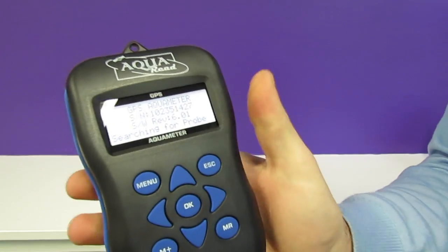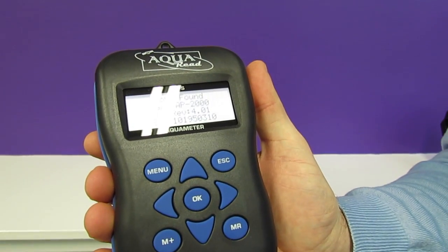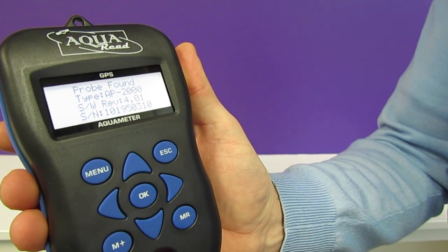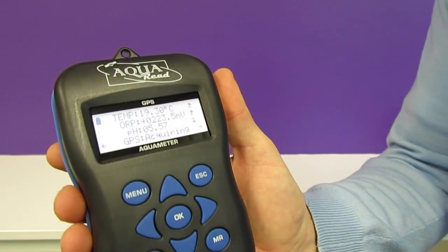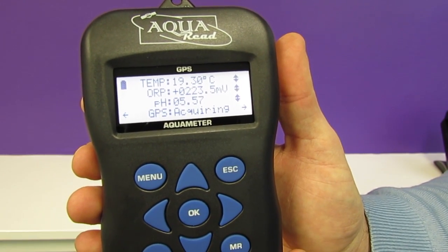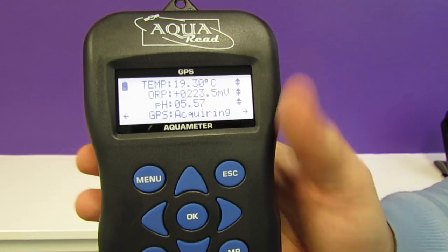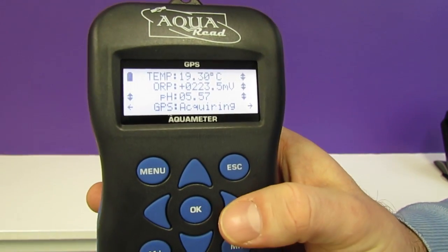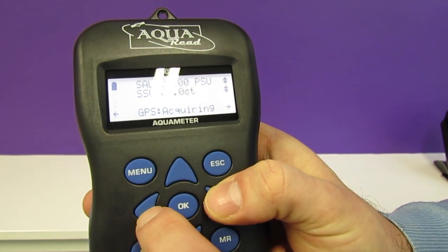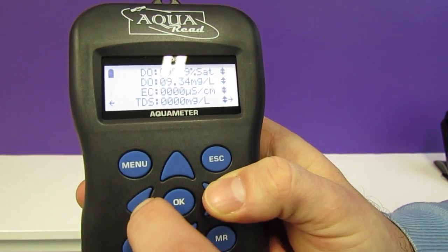We can now turn the meter on. The meter will check for the probe and we're ready to start taking readings straight away. You can scroll across on the screen using the left and right buttons to display all of the parameters that are currently being measured.